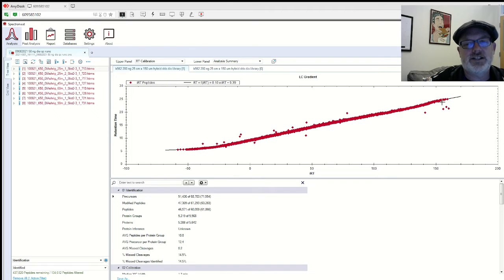So this is basically just a prediction of how the hydrophobic peptides match with reality. And it looks really good. You can see these curves aren't exactly linear, which we see all the time. So it's not strictly a linear regression. It's some other sort of regression.